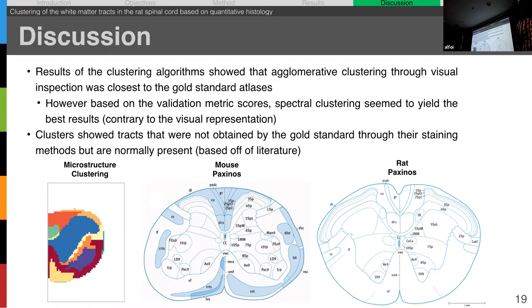I think they're both tied together. If the image resolution is a lot lower, the segmentation will be less accurate, which will then give worse results. At the same time, you need a segmentation tool that is able to pick up on these smaller axons. I don't know if there's a tool that's much better out there that could really pick up on these small axons with the image resolution that we have. But for now, this is what I've seen so far.